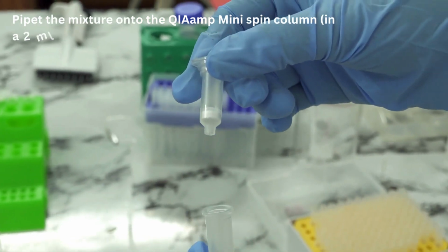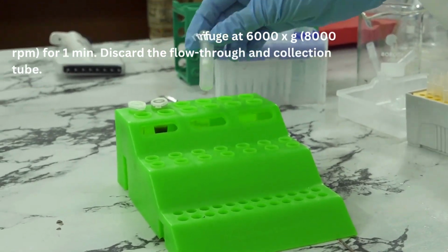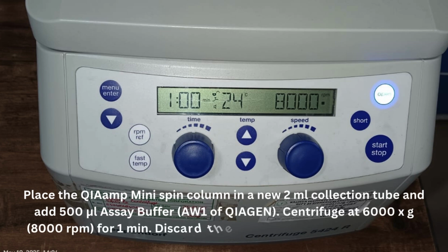Pipette the mixture onto the QIAamp mini spin column and centrifuge for 1 minute. Discard the flow-through and collection tube. Place the QIAamp mini spin column in a new 2 ml collection tube and add 500 microliters of QIAGEN wash buffer AW1. Centrifuge at 6000 xg, 8000 revolutions per minute, for 1 minute. Discard the flow-through and collection tube.